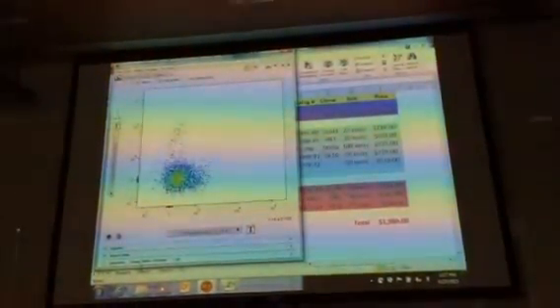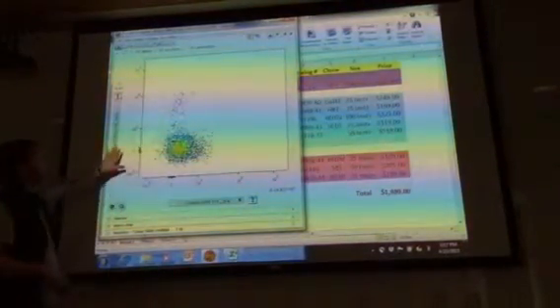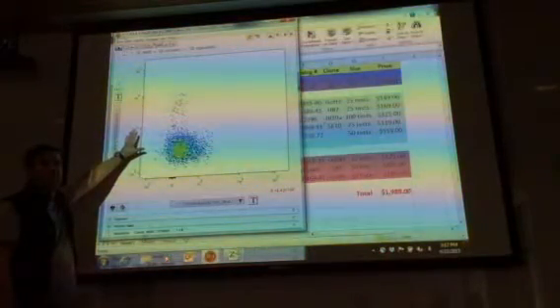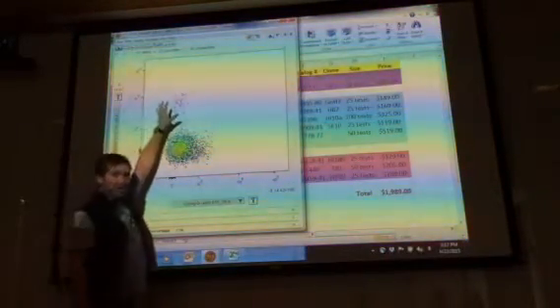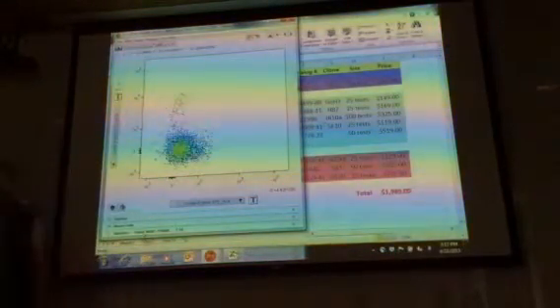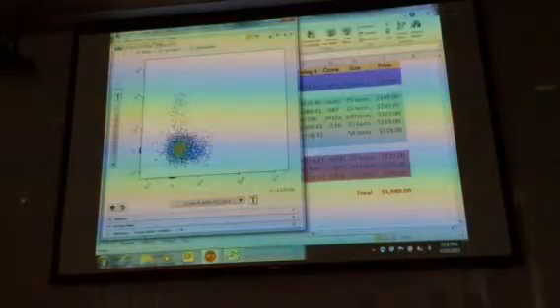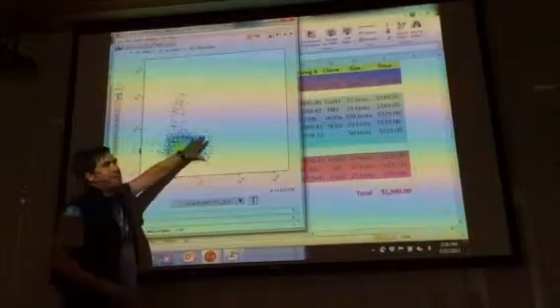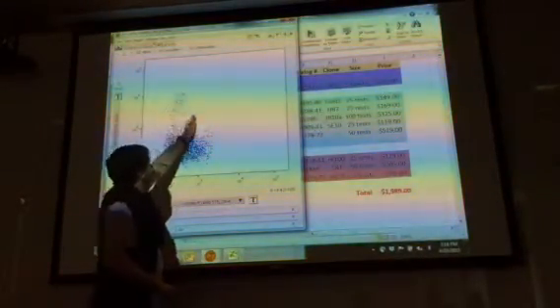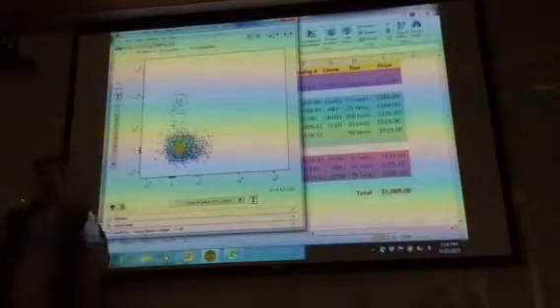So this is what we have. This is CD90 along the bottom. This is CD45RA. Now, where do you draw the gates? Can you actually use the data that's there to draw the gates? I would argue that you can, because you could argue that this is a negative cell population, this is a positive cell population, and similarly here you would have your cutoff so that this is a negative cell population and this is a positive cell population.